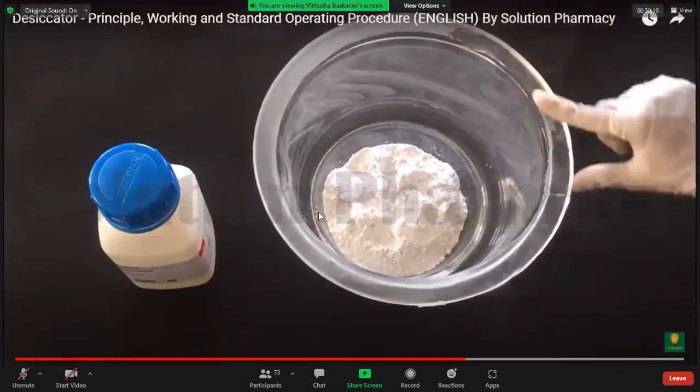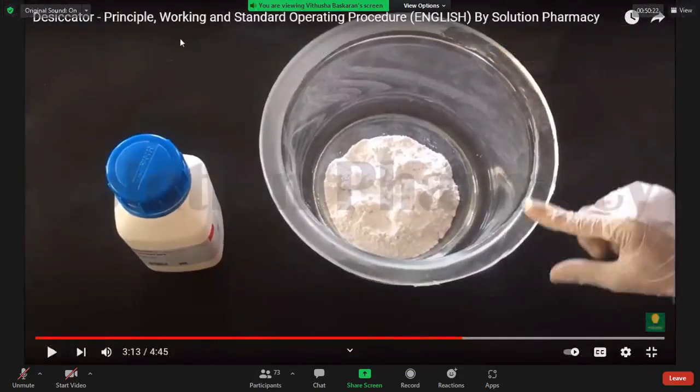So why she is applying the Vaseline? Why she is applying the Vaseline around the rim of the desiccator? Anyone? Avoid the airtight. Okay, for providing airtight condition.